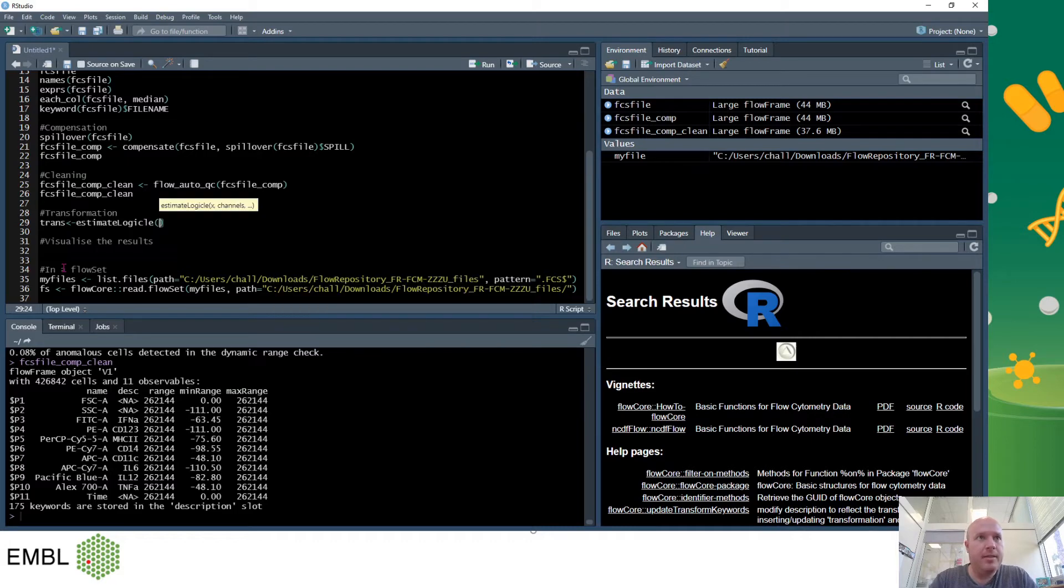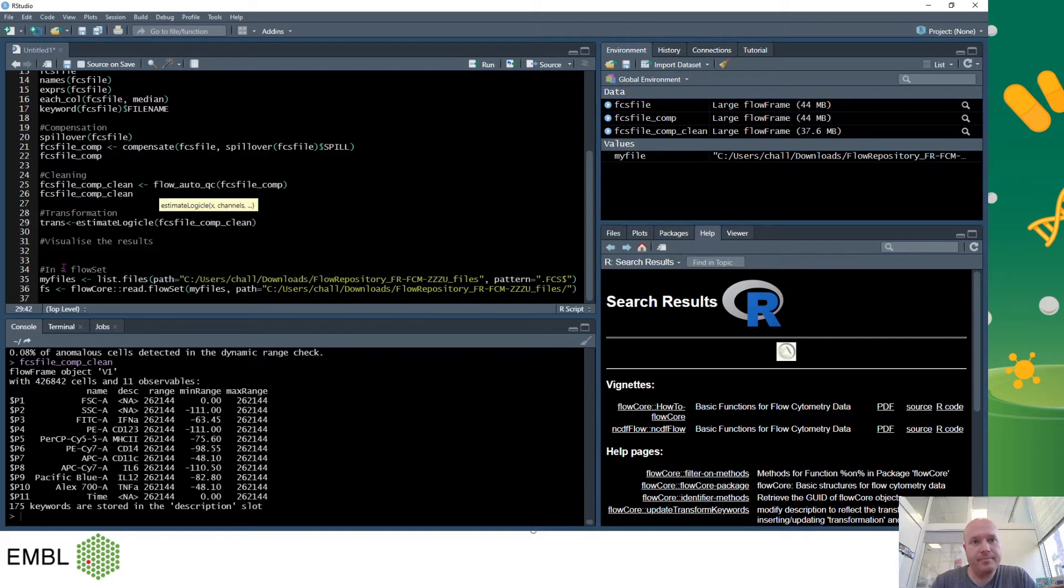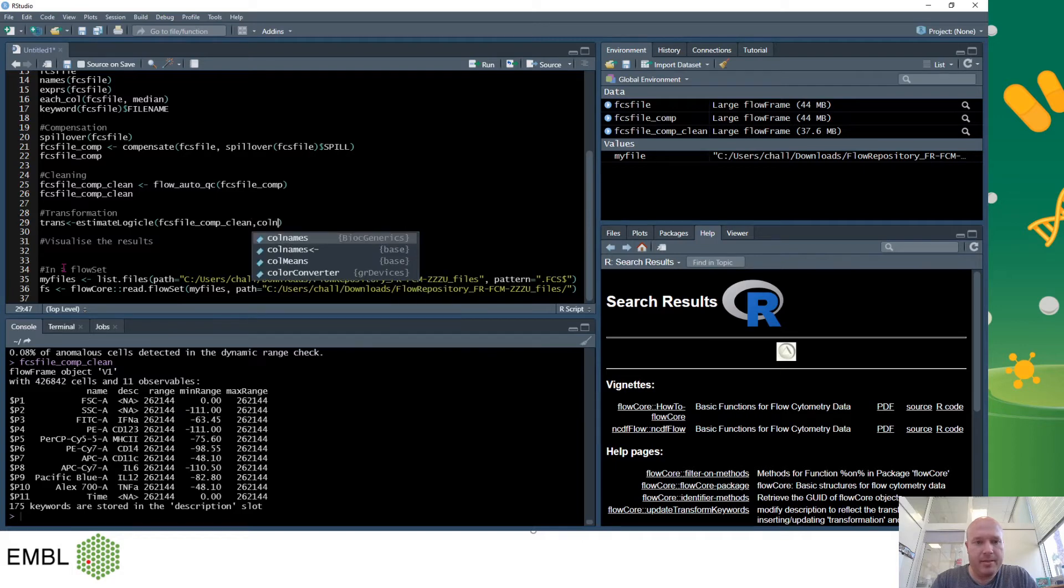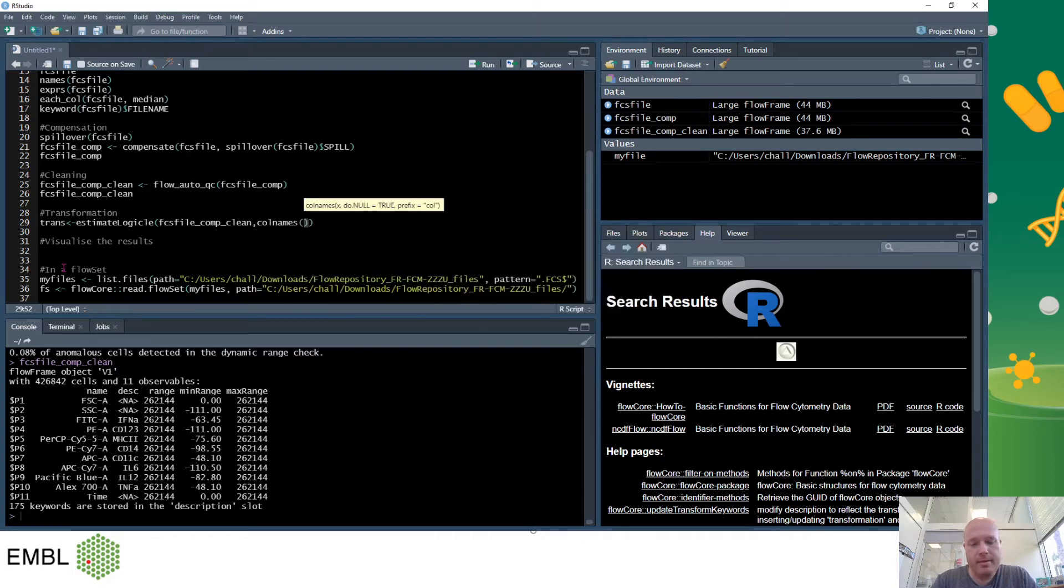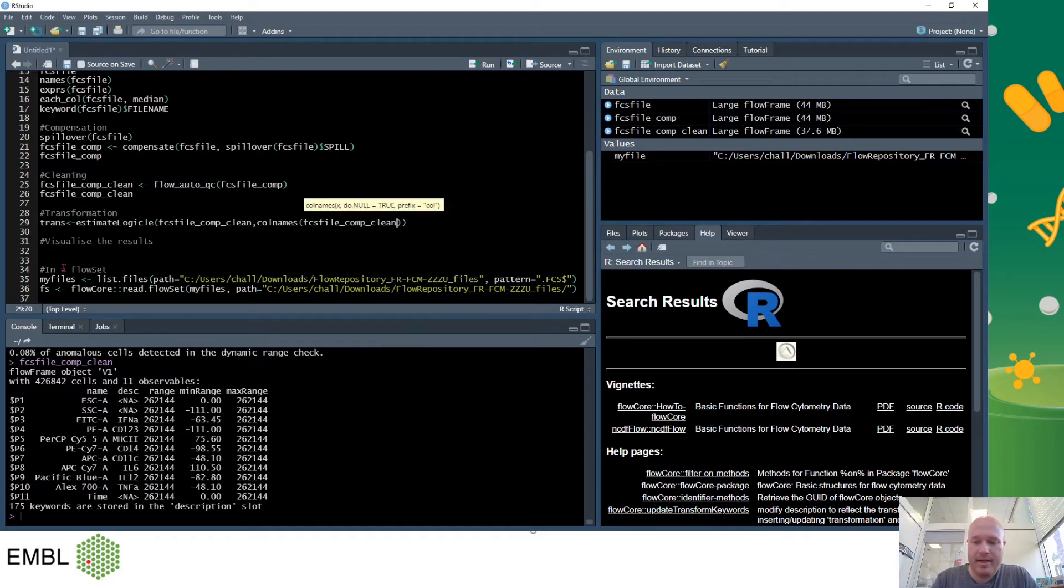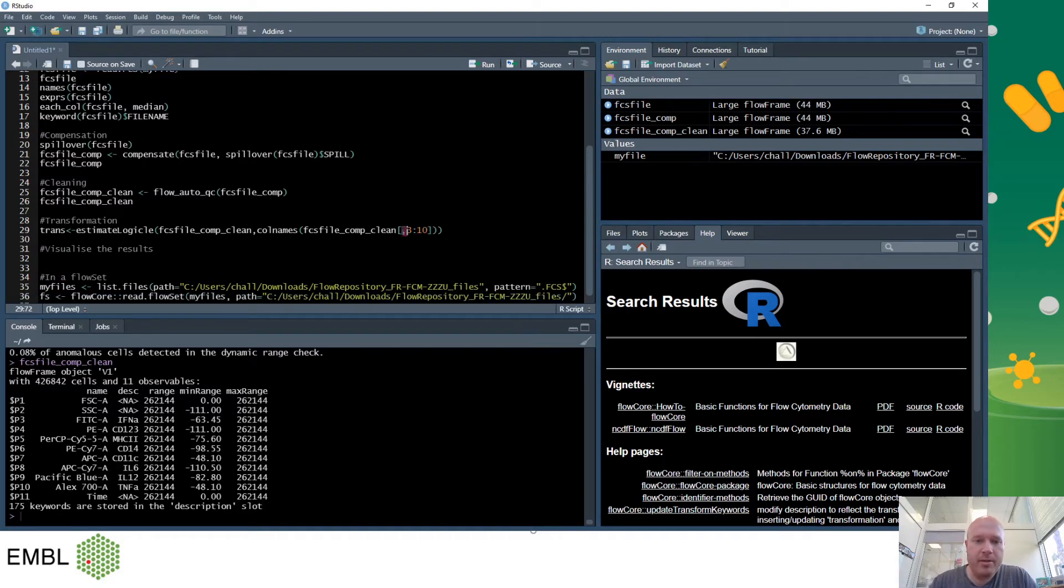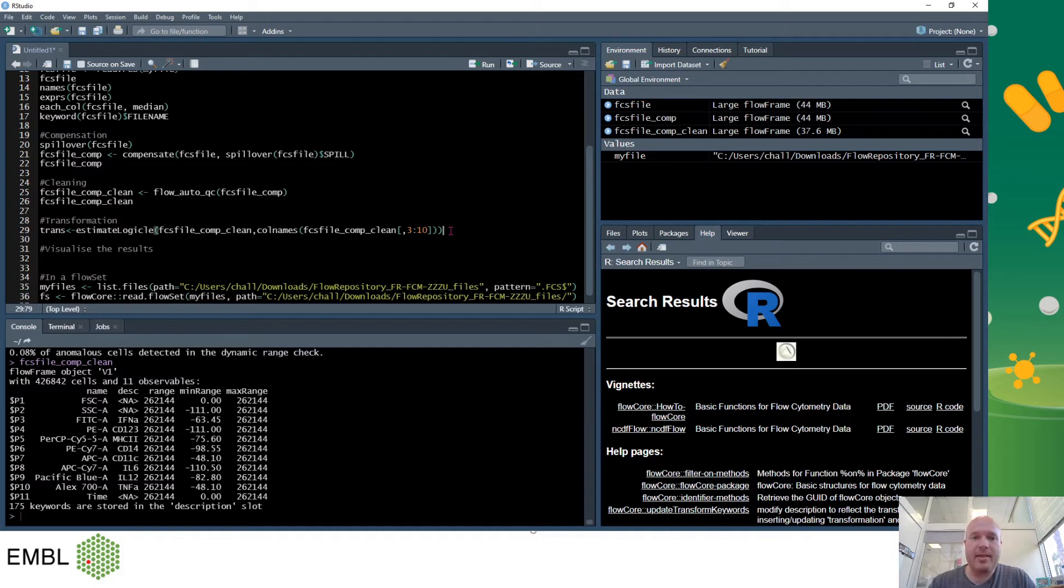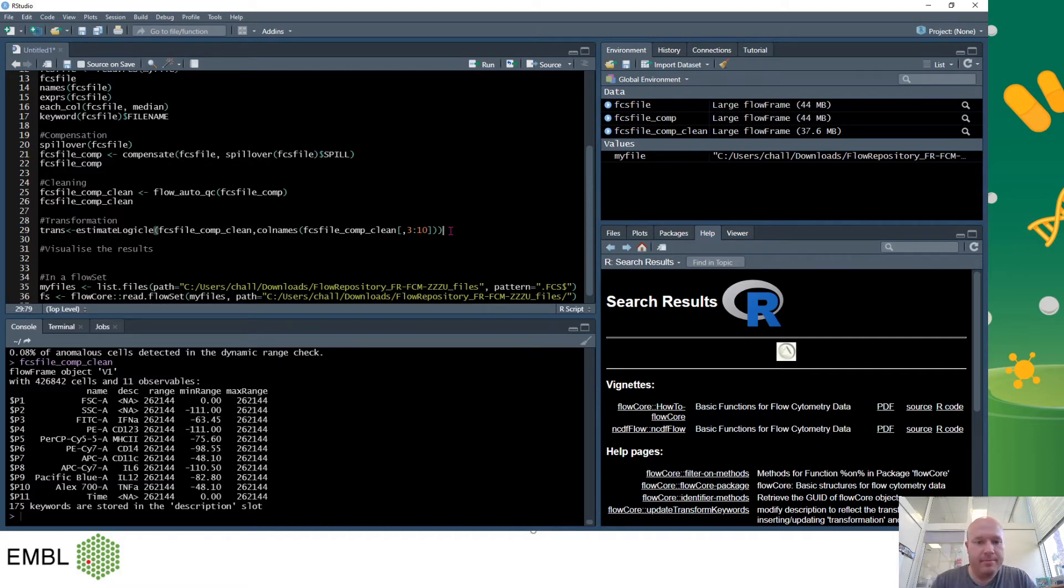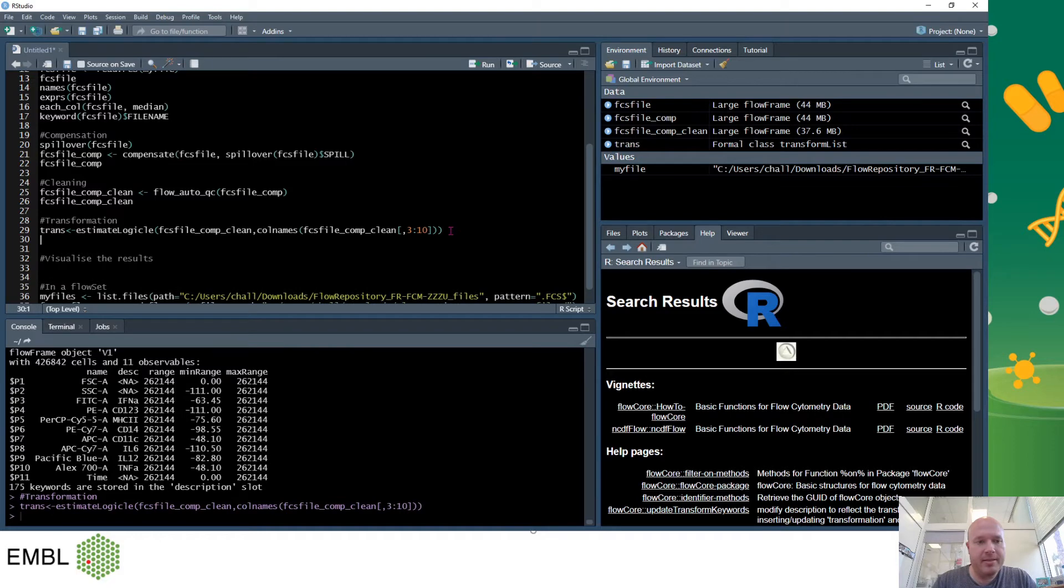So I'll add the command col names and then the FCS file again comp clean and I only want to use the ones 3 through 10. So you'll see I've put a comma at the start of this, that's because it's an xy axis and I want to be looking at the columns. So to look at the columns I need to say that I'm ignoring the rows, which is there's nothing before the comma, and now I'm looking at the columns 3 through 10. So that's produced a new variable called trans that has the calculations for the transformation.